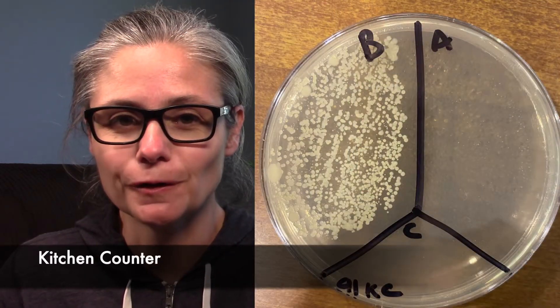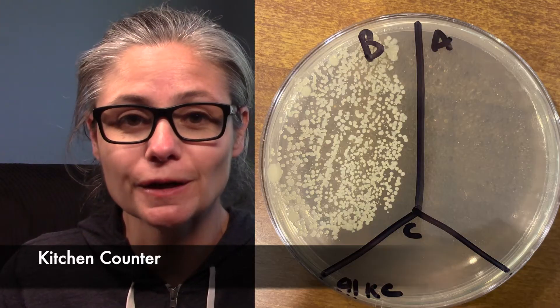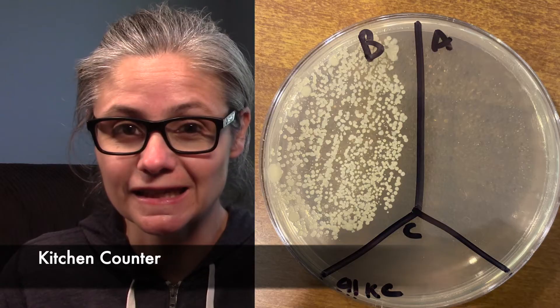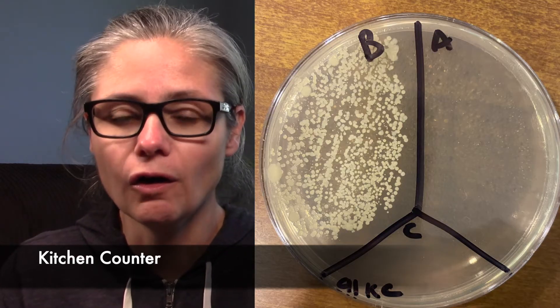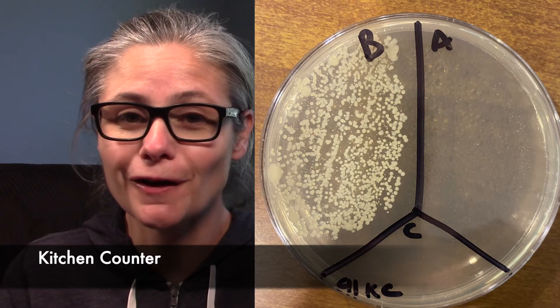The kitchen counter. Here we see in the before section, plenty of bacteria that we picked up from the kitchen counter. In the after section, there is nothing — we have zero, no bacterial colonies at all in my after section. 91% isopropyl alcohol does an excellent job at disinfecting my kitchen counter.